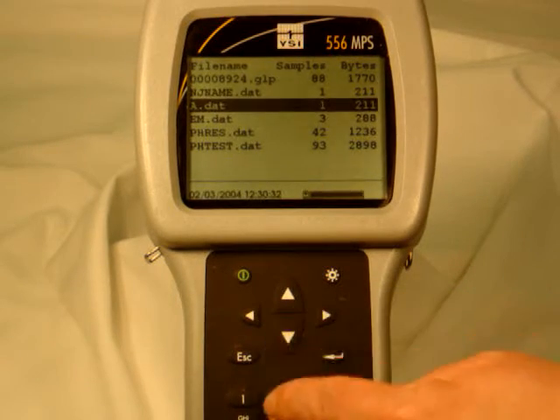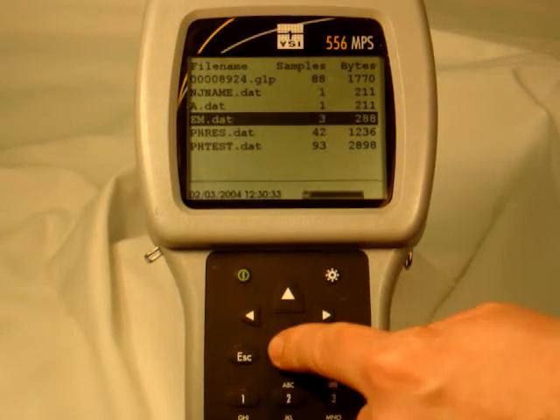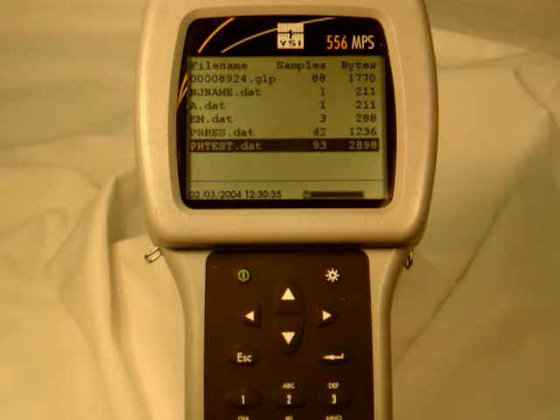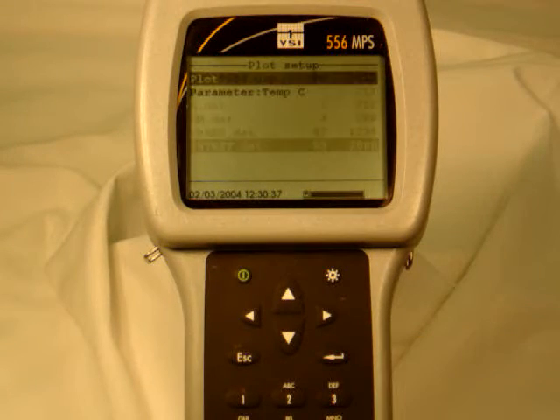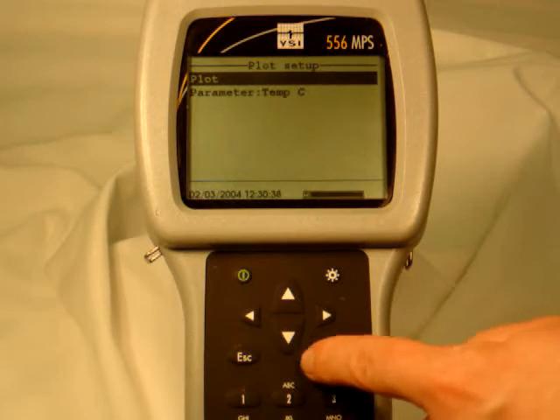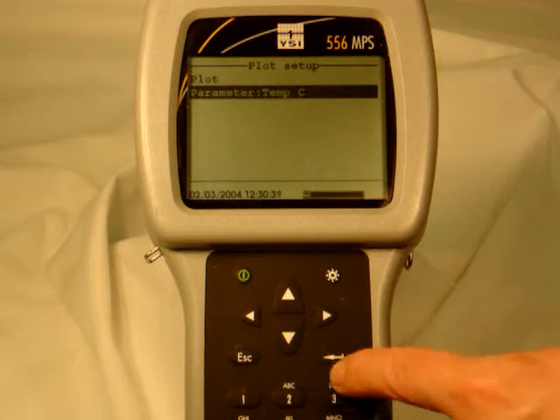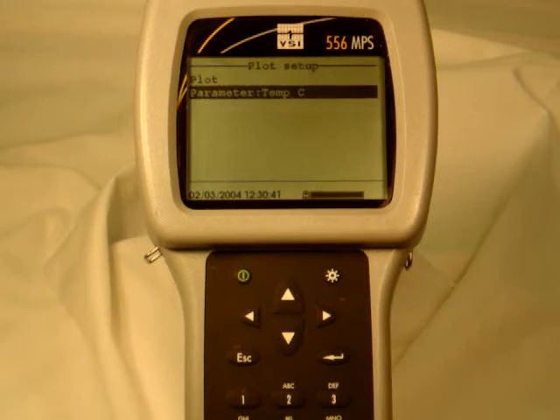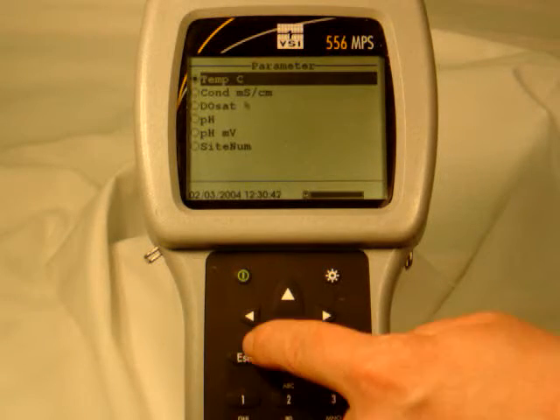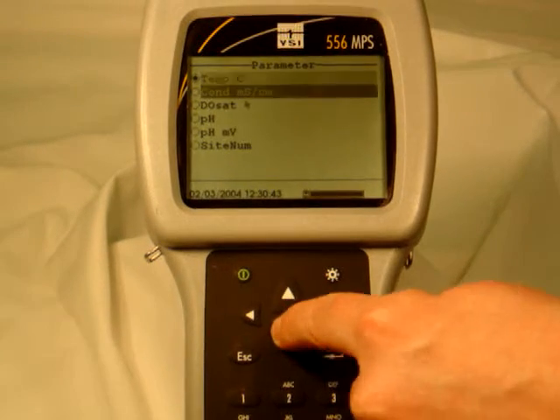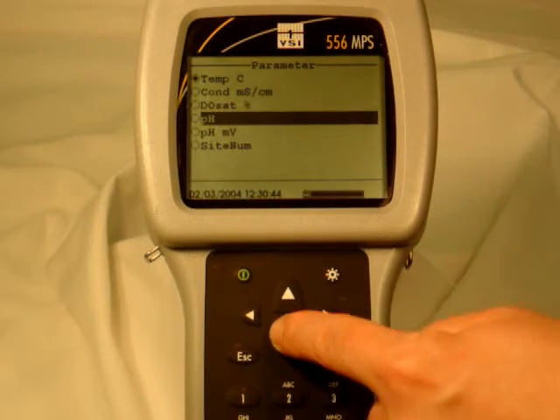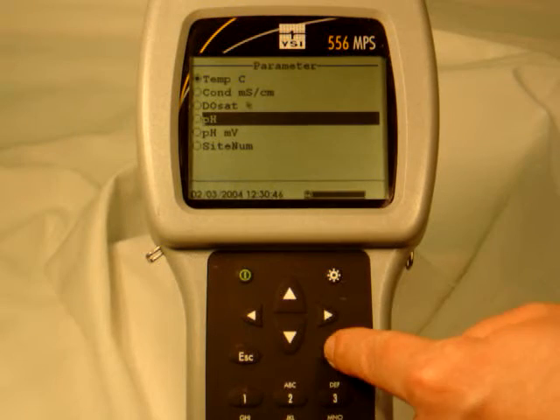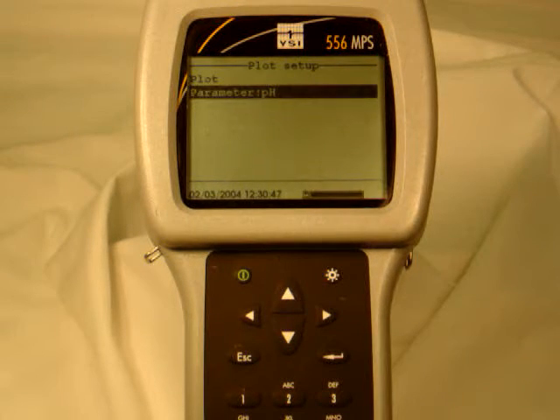I think we can work out that bit. It's coming out of here. A bit bigger than I thought. It's probably worth having this base set up.